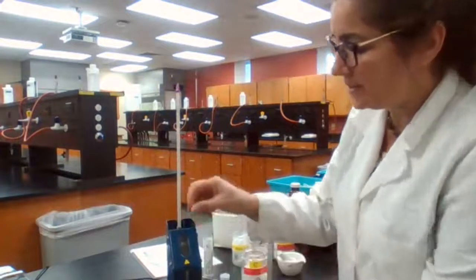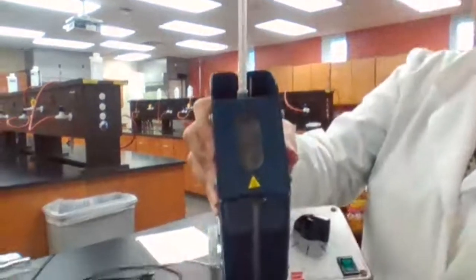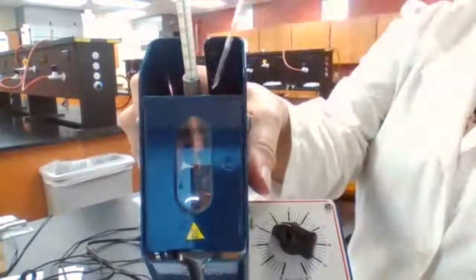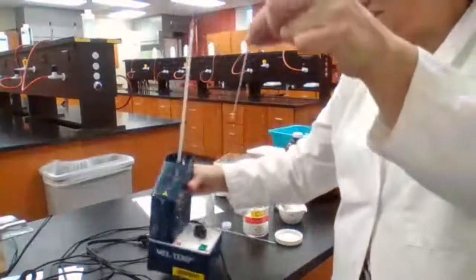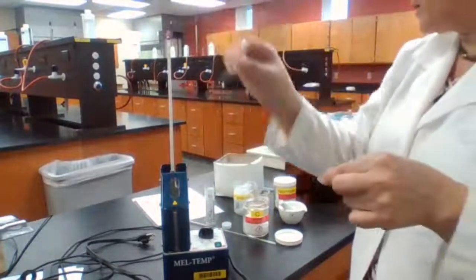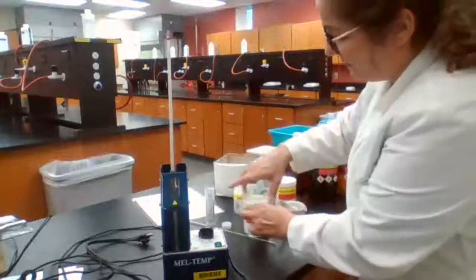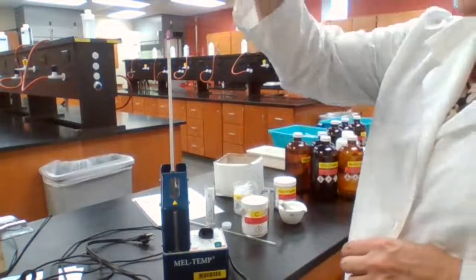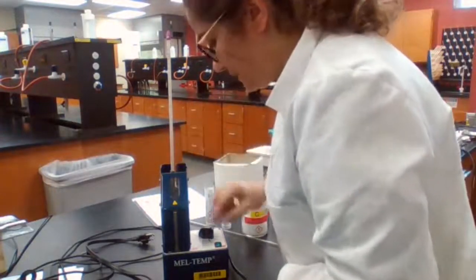Okay, I'm going to take it quickly and show it to you. You can see from the magnifying glass that this sample is now melted, and I'm going to take it out. This is the melted sample. I dispose of this into a disposable glass box later on. And now I prepared my unknown sample C. I placed the unknown sample in the melter and turn it on.